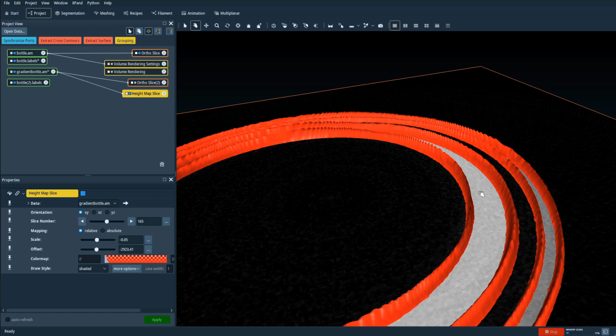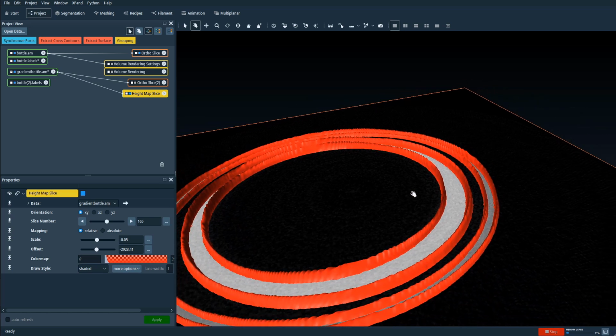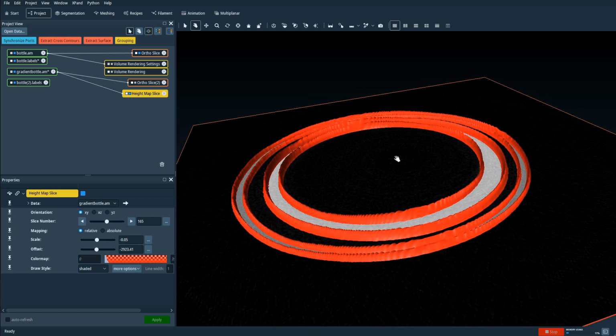Once the water from two different materials meet on top of this wall, then the meeting line, or the region where those two materials meet, is what we call the watershed line. We can use the watershed line then to separate the two materials, and therefore segmenting the two materials. That's the general idea for the watershed algorithm.